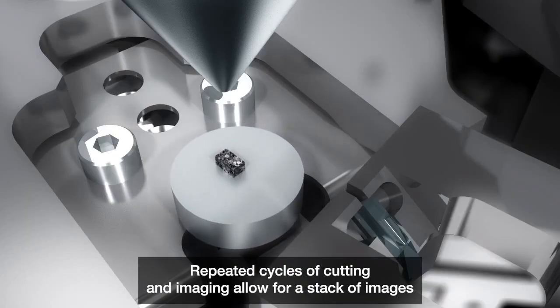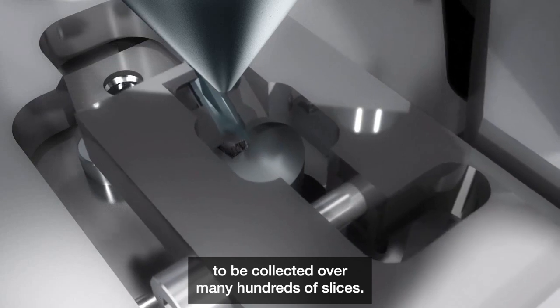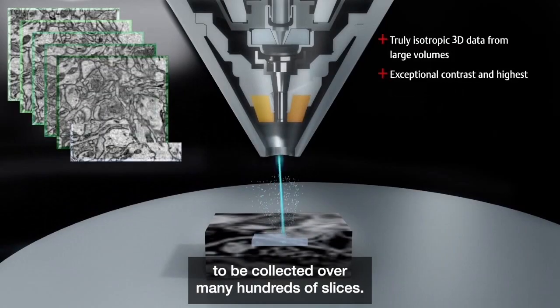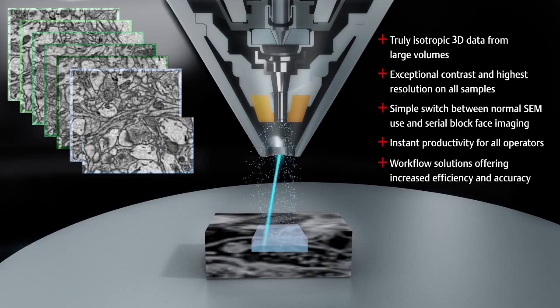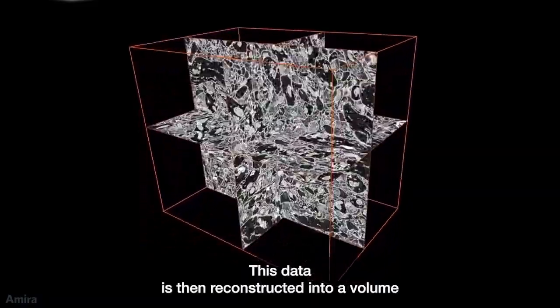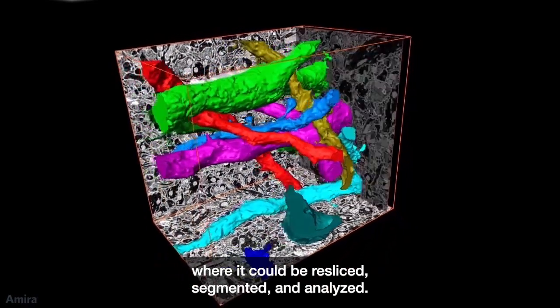Repeated cycles of cutting and imaging allow for a stack of images to be collected over many hundreds of slices. This data is then reconstructed into a volume where it can be resliced, segmented, and analyzed.